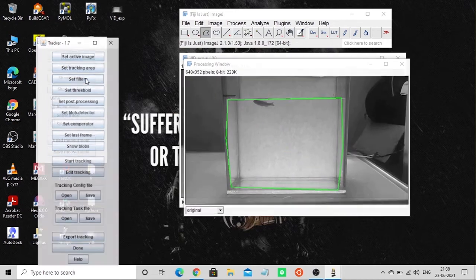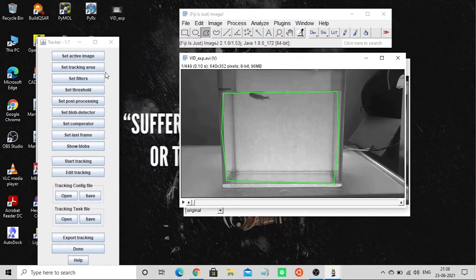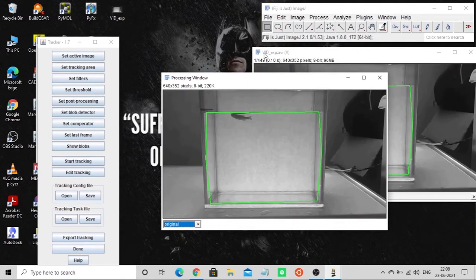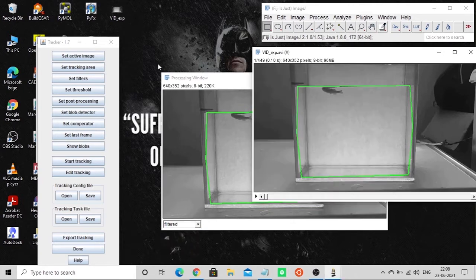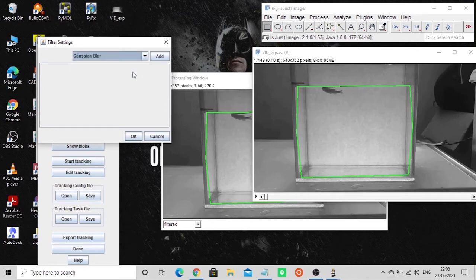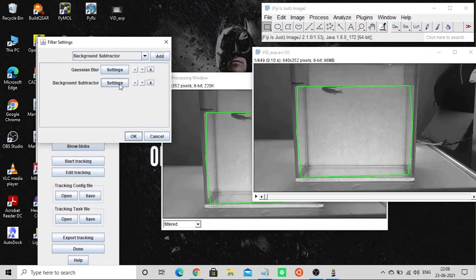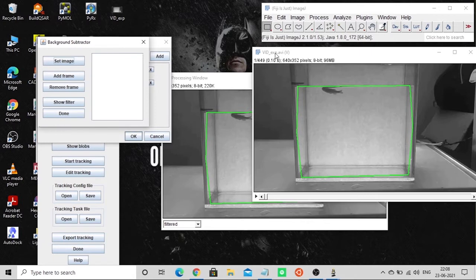Now we are going to run the tracker. This is the processing window — just click Go. Now I'm going to do the filtering process. Click Set Filters, then Add, and add the background subtraction filter. I'm going to make some changes here and set the edge settings.